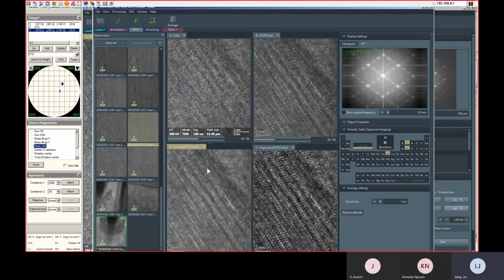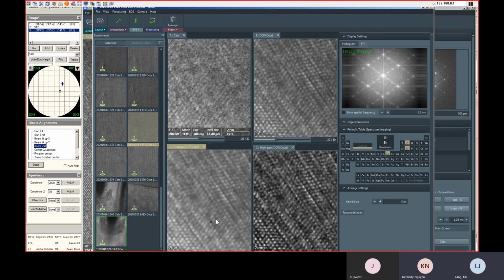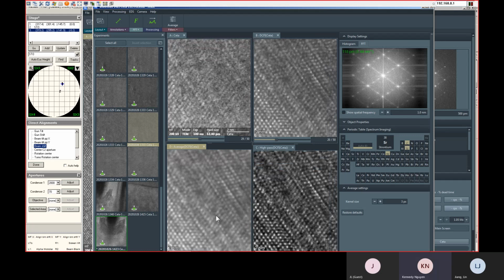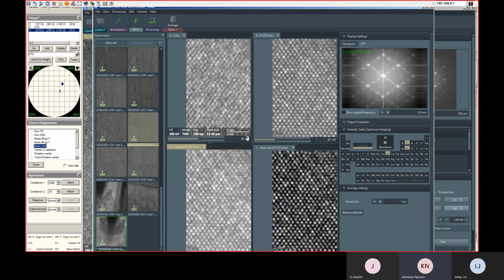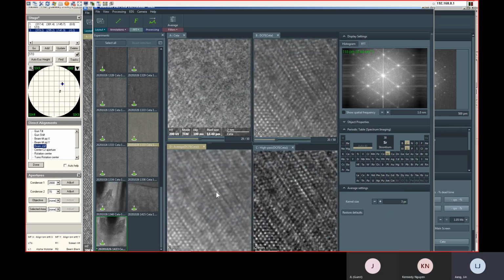Yeah, you can see contrast improves a lot. But compare to the averaging. Well, I guess here we can see some twin boundaries. See, the averaging looks better than the original at least. Yeah, because you further improve your signal to noise ratio by averaging the signal.